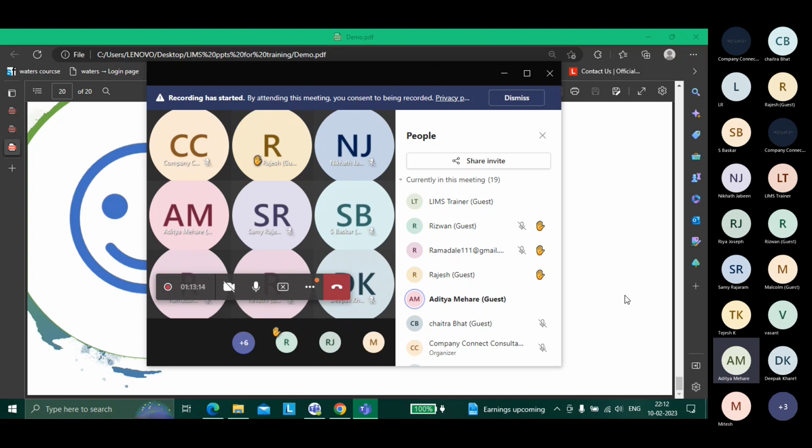Can we learn how to create master data more and more fast so that we can create within a specific timeline? I cannot give you that surety of fast, but how master data is created, I can at least tell you the table structures, where you create in LabWare LIMS, I can tell you. Fast, I cannot tell you.